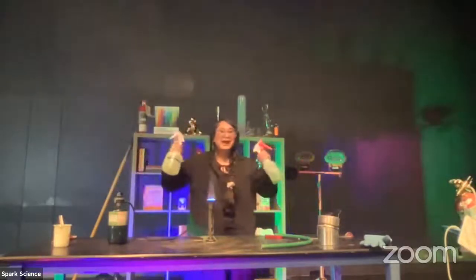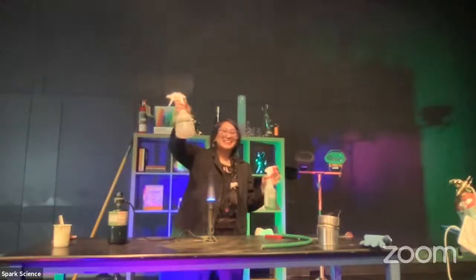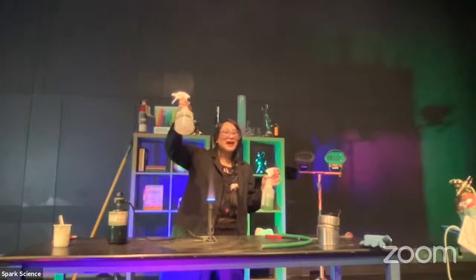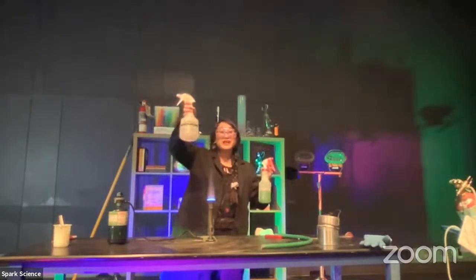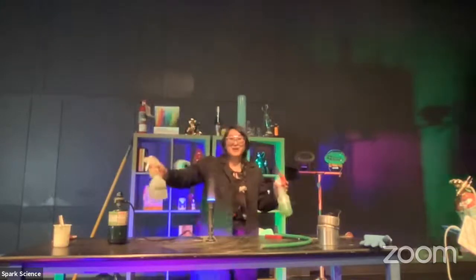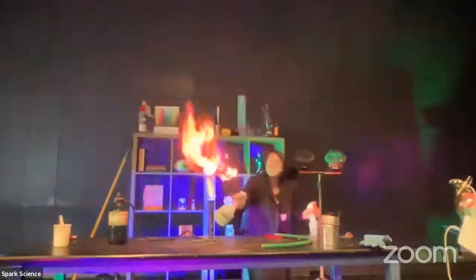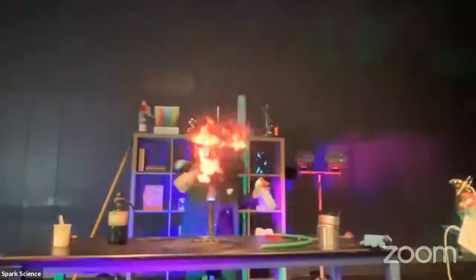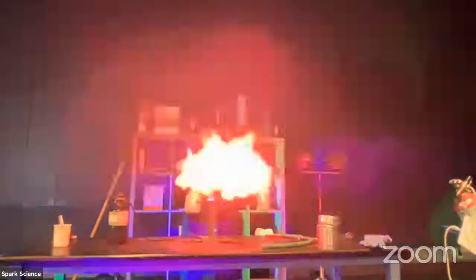Now, I want you to guess, what color do you think strontium, a metal, will burn? It looks like clear liquid here, kind of looks like water. Put in your guesses down below or think about them to yourselves. Strontium. Here we go. Ready? In 3, 2, 1. Ha-ha! Strontium burns a beautiful, vibrant red.